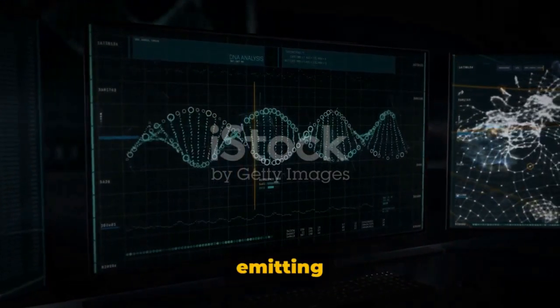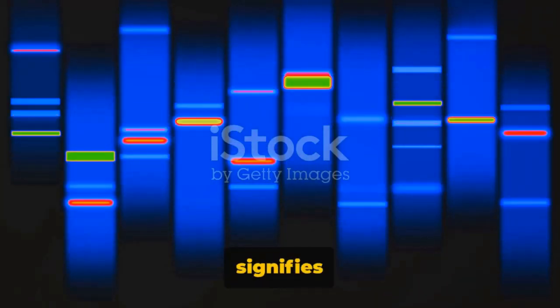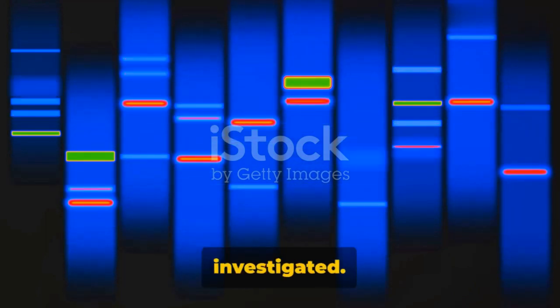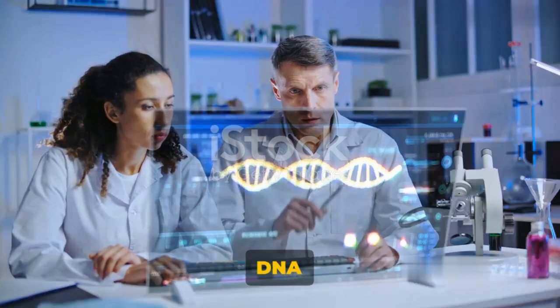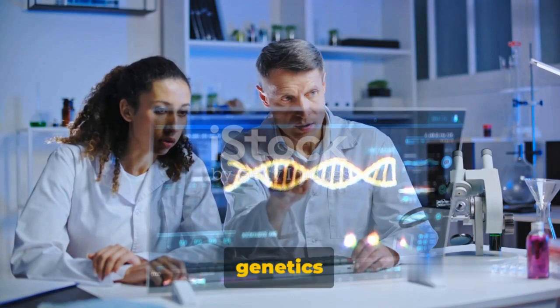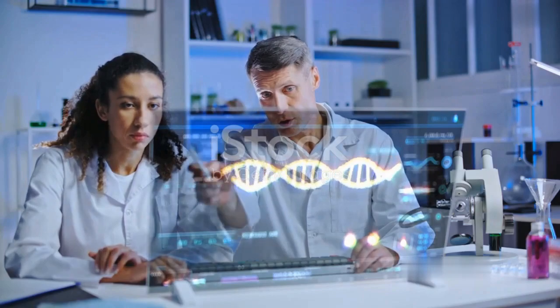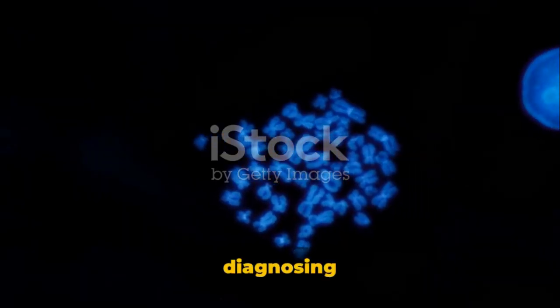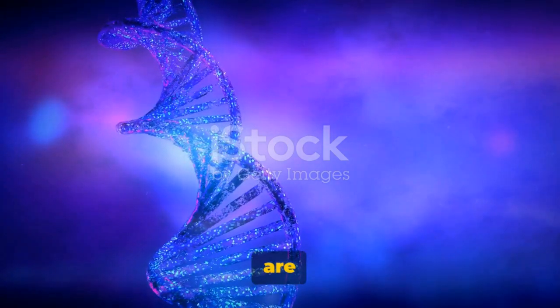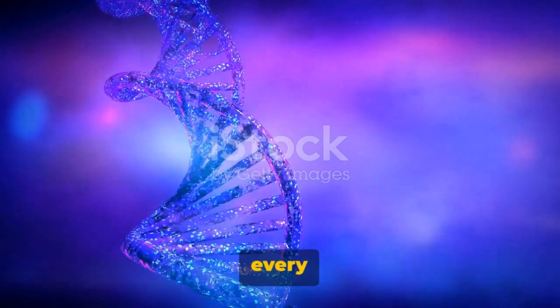These markers work by emitting light upon binding with the DNA, providing a glow that signifies the presence and the amount of the specific DNA sequence being investigated. This real-time tracking of DNA amplification is what makes real-time PCR a powerful tool in the world of genetics and microbiology. From identifying viral infections to genetic mutations, and from diagnosing diseases to research in gene expression, fluorescence markers are the unsung heroes, silently illuminating the path for every breakthrough.